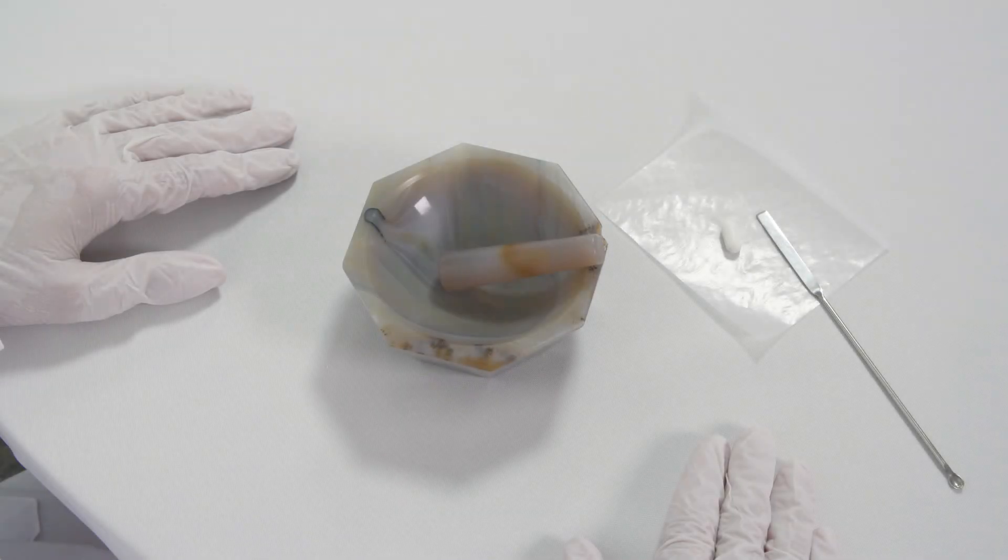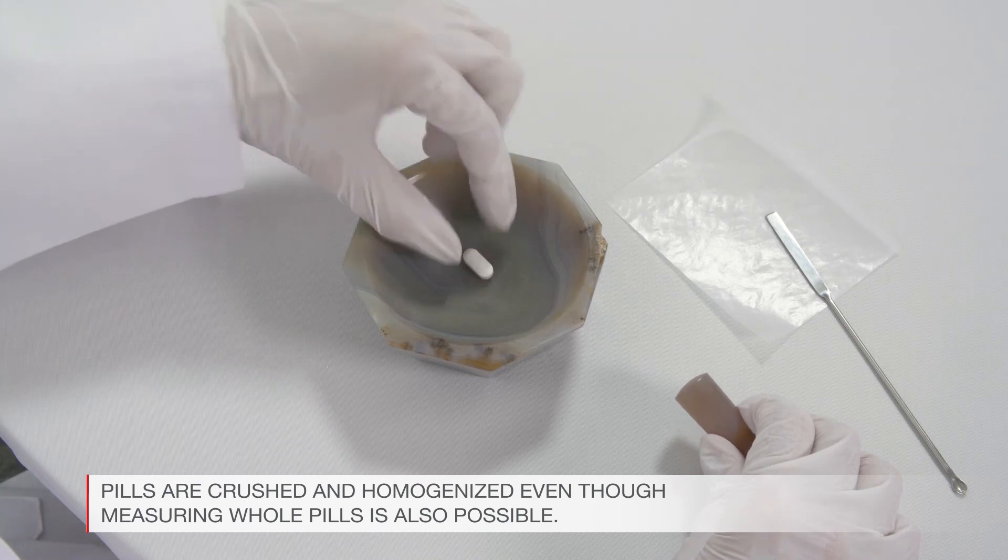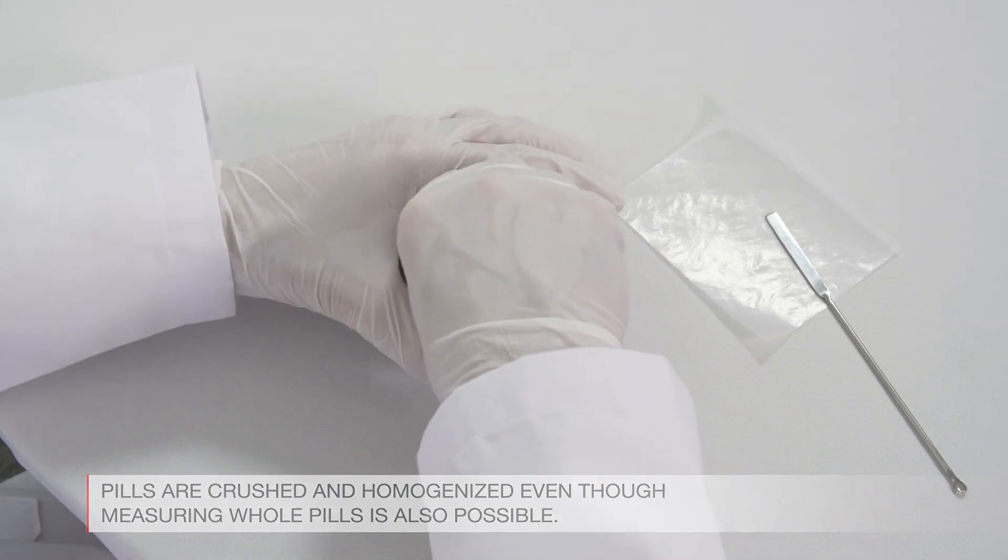For narcotics or counterfeit drug analysis, pills are crushed and homogenized, even though measuring whole pills is also possible.